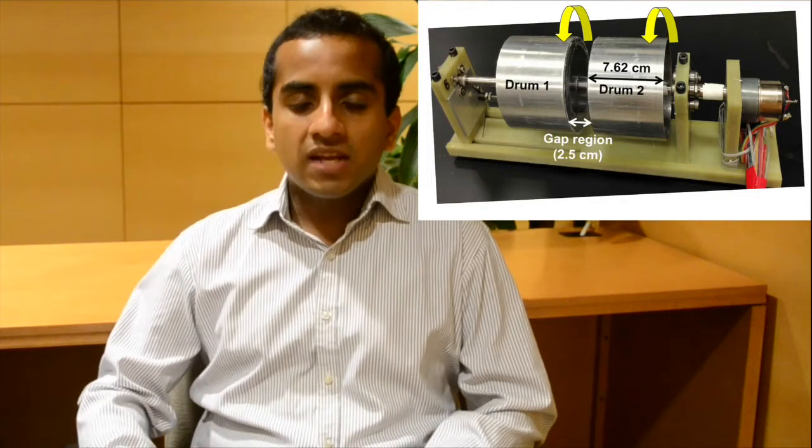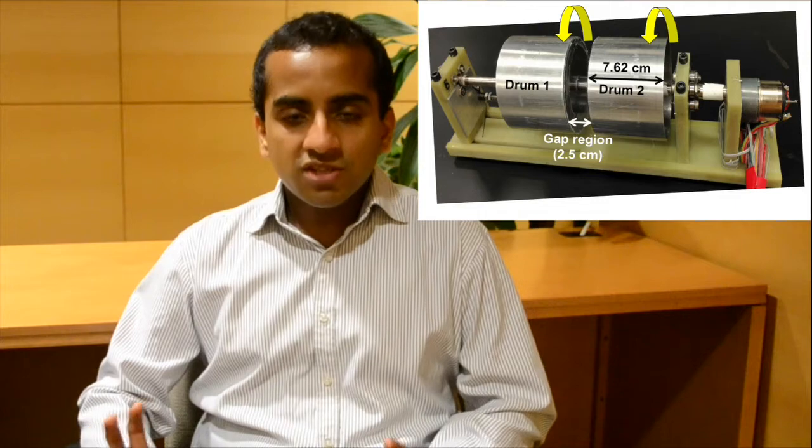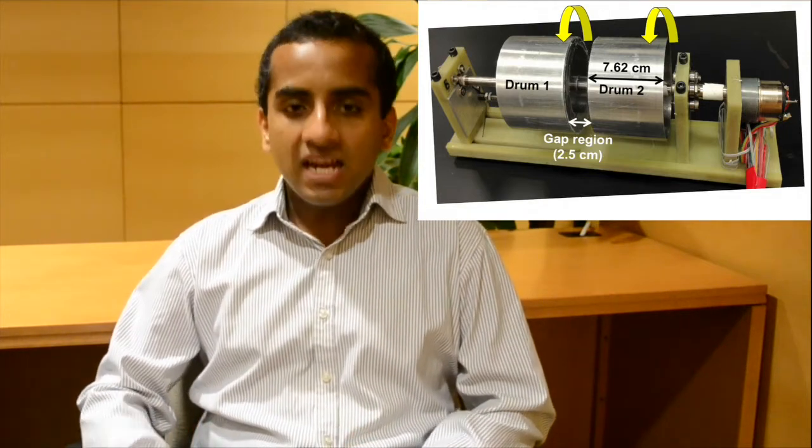Therefore, what we want to do in this work is to recapitulate the properties of bone patella tendon bone autografts within electrospun scaffolds, and use such scaffolds towards the regeneration of complex tissue transitions such as those found at bone-ligament interfaces. Towards this end, we have constructed a dual drum collector that can help create electrospun meshes possessing region-wise differences in fiber alignment, chemistry, and diameter.